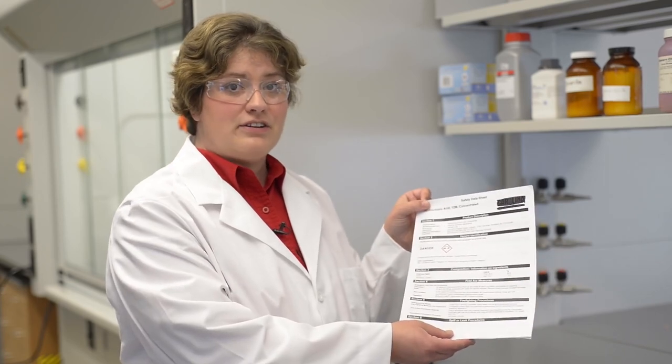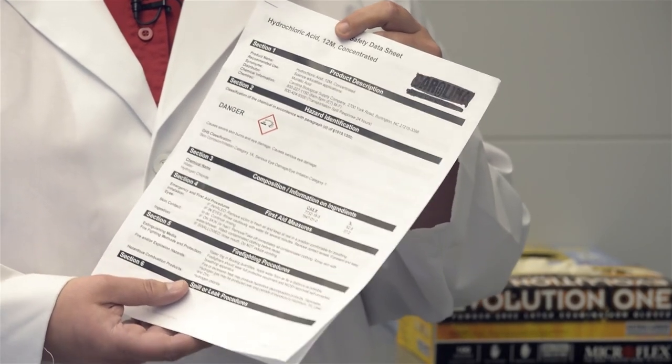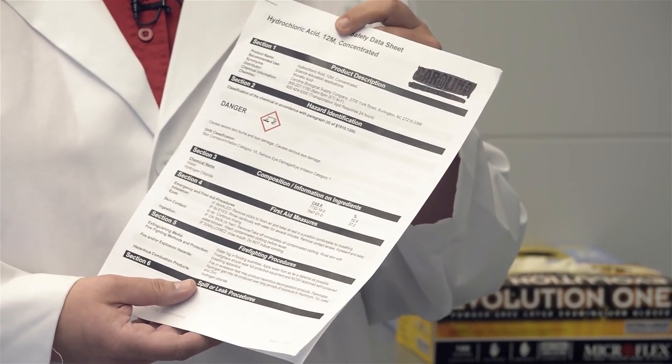When working with chemicals in the laboratory, you want to be familiar with the hazards they pose, both to your health and in their ability to react with other chemicals. Refer to a safety data sheet or a material safety data sheet to learn about proper handling instructions, storage instructions, and also any PPE requirements.